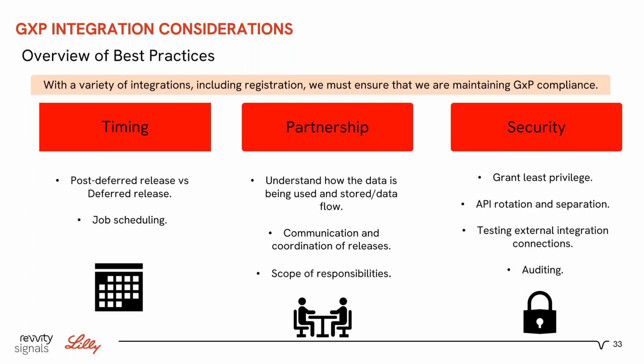So deferred releases are the releases we're receiving from Revvity that are pushed to our production environment 3 times a year. So when that time is going on, we're really just trying to focus on those new features and getting those tested and validated so we remain GxP compliant.